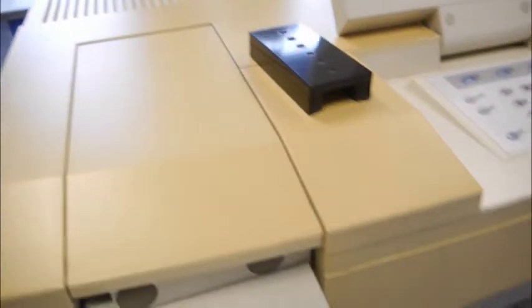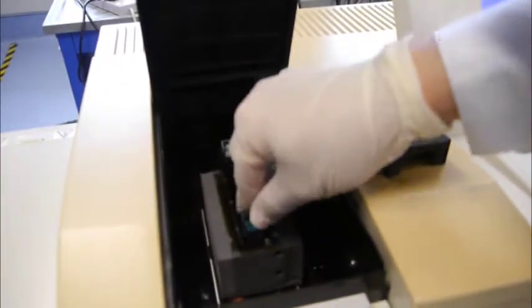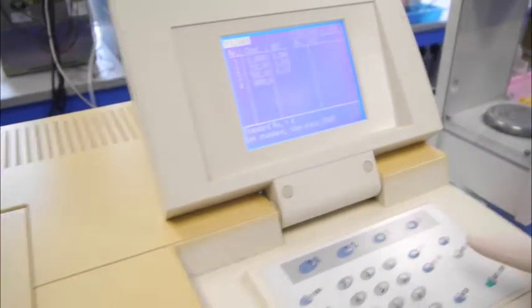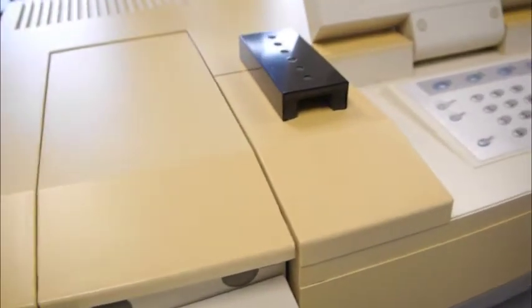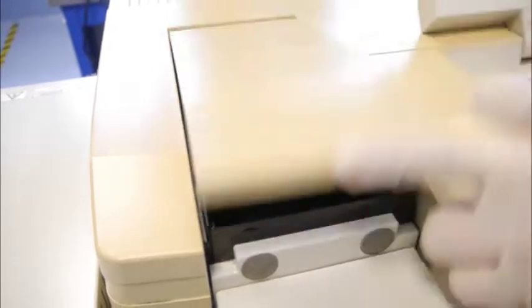Once you have done that, take out the cover and insert your third standard, which is 500 ppm, into slot 1 of the sample holder. Cover with a cap and press start. After you have done that, remove the sample cuvette from the sample holder. Place in your last standard solution, which is 1000 ppm, into sample holder number 1. Cover and press start.